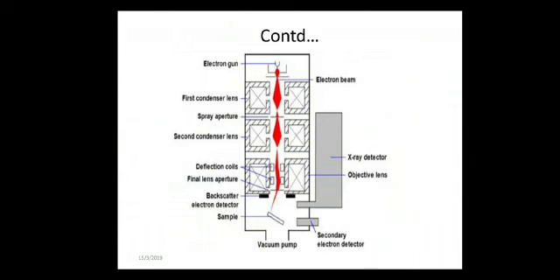If a researcher wants to increase the magnification of an image, he or she simply sets the electron beam to scan a smaller area of the sample. Once the smaller area is scanned, the image can be seen clearly.